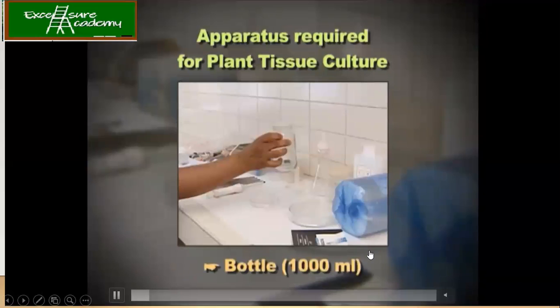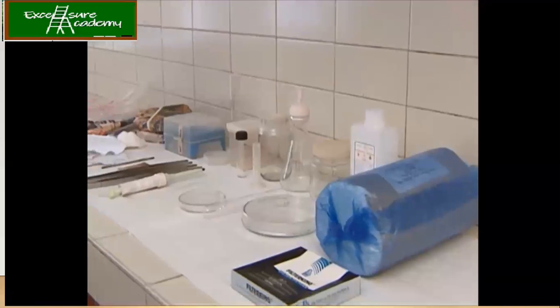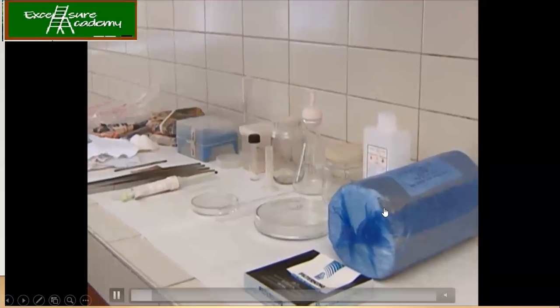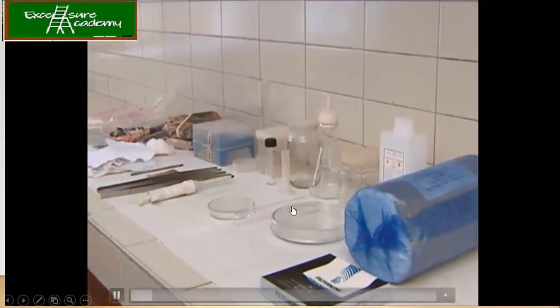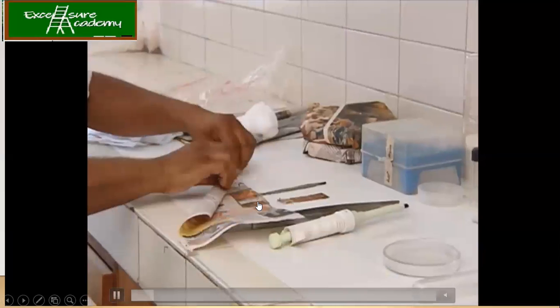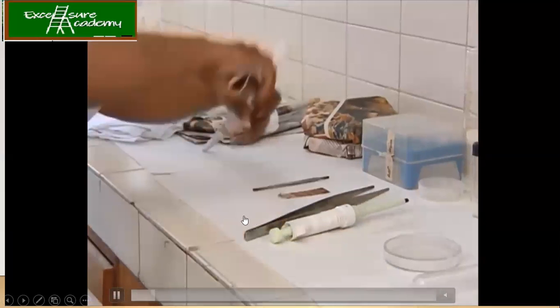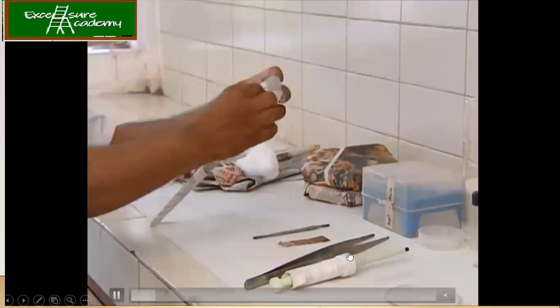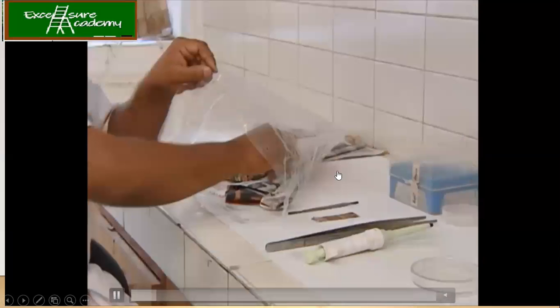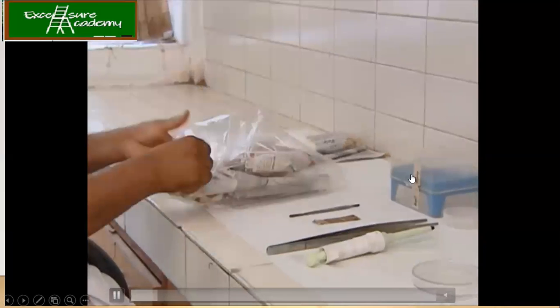Now reusable pipettes are there, bottles are there. These are glass bottles, so you can wash them once they have been used. So you keep everything ready. You can see everything has been autoclaved and kept ready over here. So this is how you do the packing of the material so that you can keep it for autoclaving. This is how you wrap all the forceps and the surgical blades, etc. Here you must have seen the glass petri dishes were also wrapped.